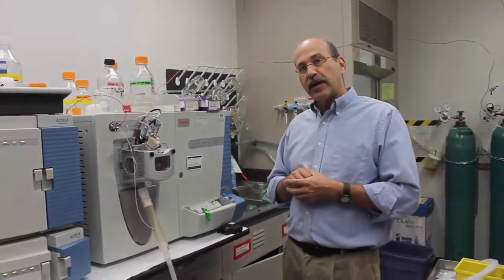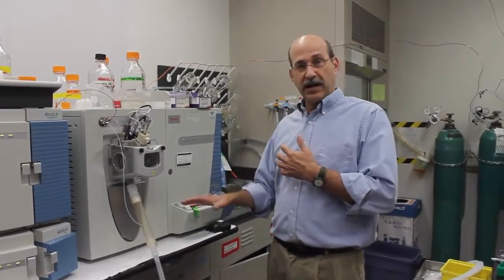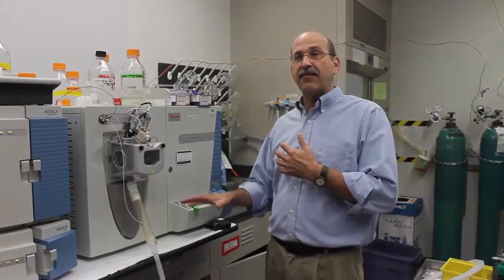One of the projects that we're looking at right now is compounds which are metabolized after you eat them. These compounds, zeranols, we think have estrogenic properties. They're from grain mycotoxins, and you would get them from eating everything from popcorn to beef. But we don't know how much people are getting. And so we're analyzing this, especially in young people, our kids who are developing and may see a greater effect from these compounds when they eat them.